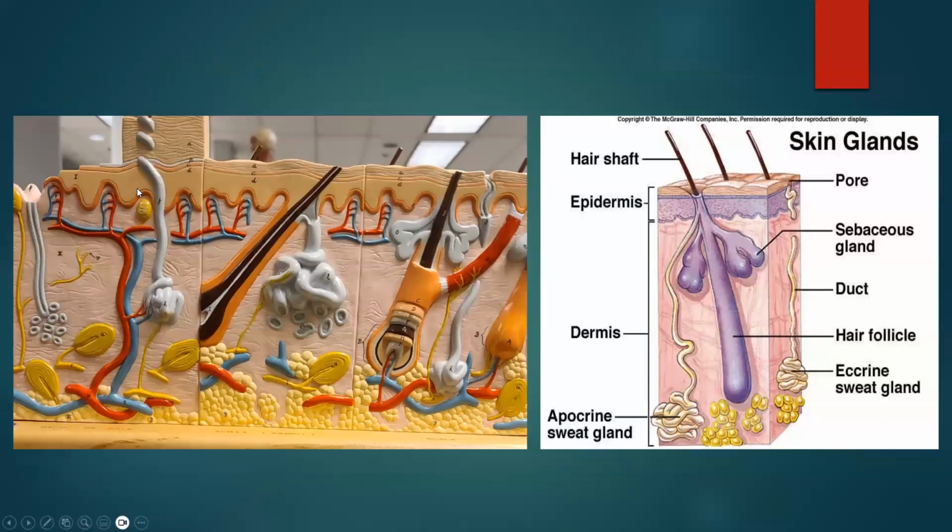So if we come back here, I didn't mention it yet, but we have a specific name for this wavy pattern made by the basement membrane. These little invaginations or dips, these are called dermal papillae. So papillae is like a finger-like projection. So within those papillae, we will occasionally have a tactile corpuscle, which is this little round yellow structure. So you can see they sit really close to our epidermis, so they are responsible for sensations such as light touch, really superficial sensory feedback.